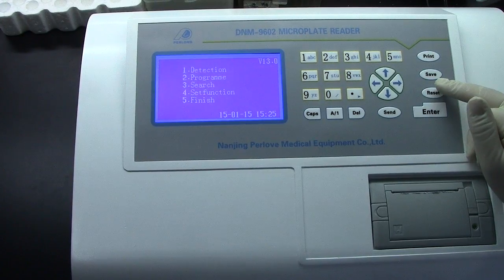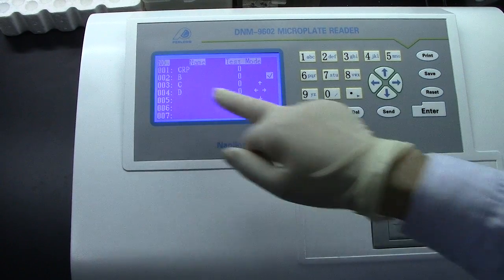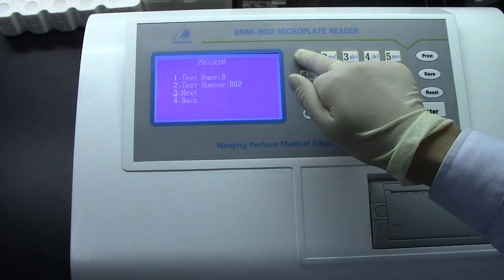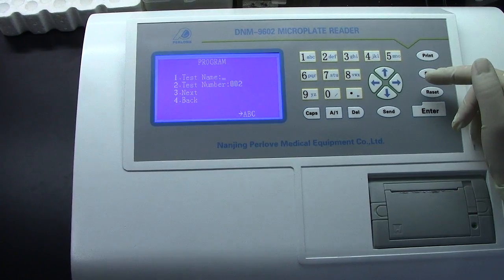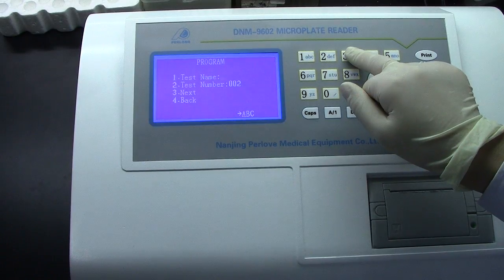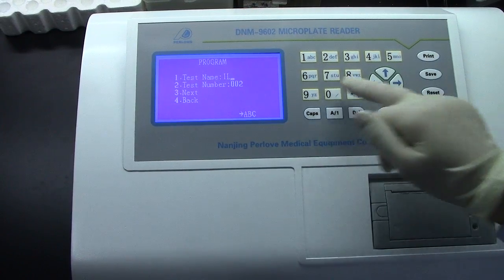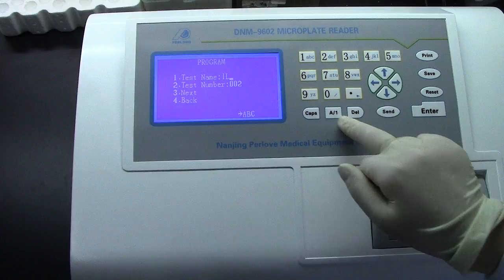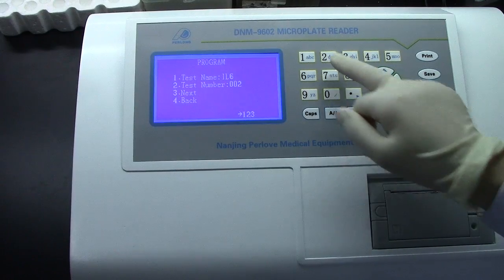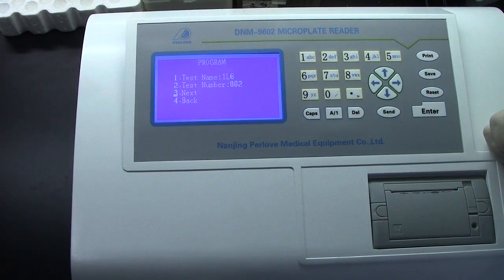Let's do program 2 — a new one. Press this. Here, 002. Press Enter to change the name. We want to input IL6. Press Enter to confirm. The test number 002 is OK.